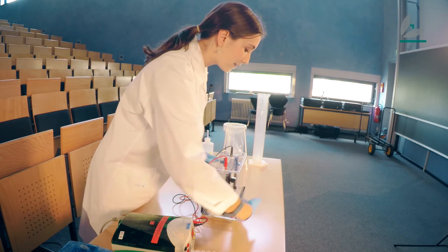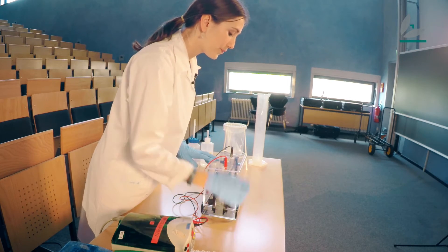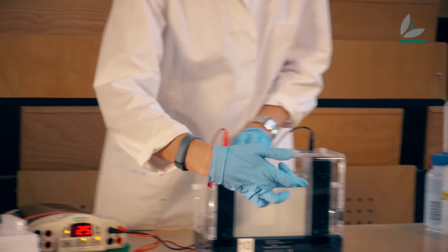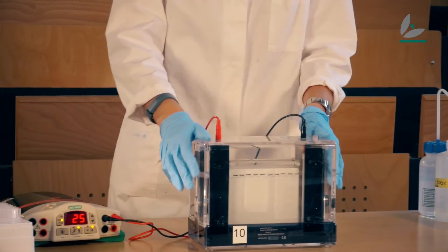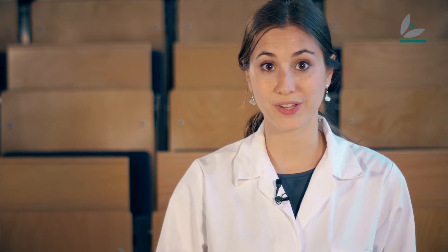The smaller proteins can run faster through the gel, so they will be found at the end of the gel in the lower part. And the bigger proteins run slower through the gel, so they will be found on the upper side of the gel. That's how I can separate my proteins by their size. This is the principle of gel electrophoresis — to separate molecules by size with the help of a current. So now it starts.